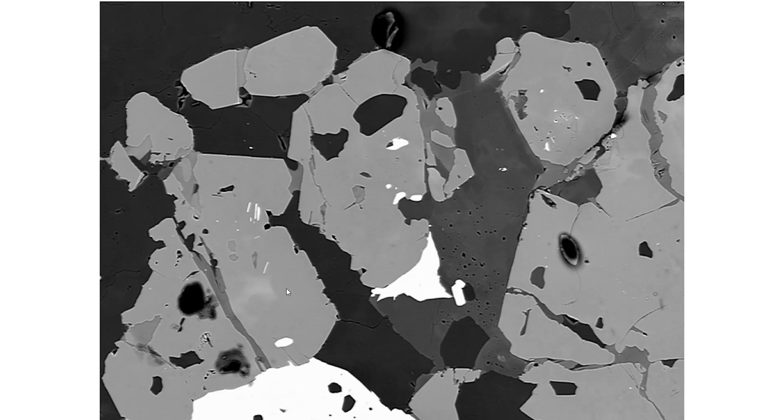If I go back to the original image, if I take this image and say this bright region has value of, I don't know, 200 pixel value and the gray region has a value of like 150 or 160, then I can just use my histogram to separate these different regions or to define these different regions. So, you don't need machine learning. In fact, please do not use machine learning. Don't overkill the problem in this case.